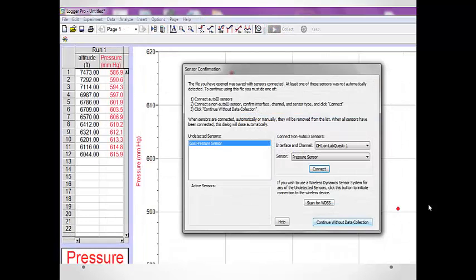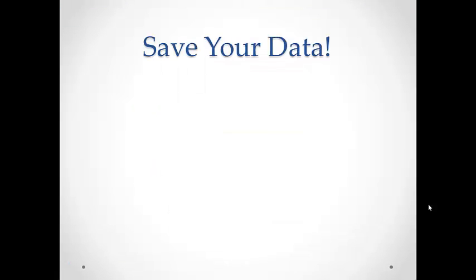This looks scary, but just click on Continue Without Data Collection at the bottom of the box. Print your graph and data table and add it to your lab notebook. Save your data to the desktop. Then write down the computer you are using, in case you need your data again.